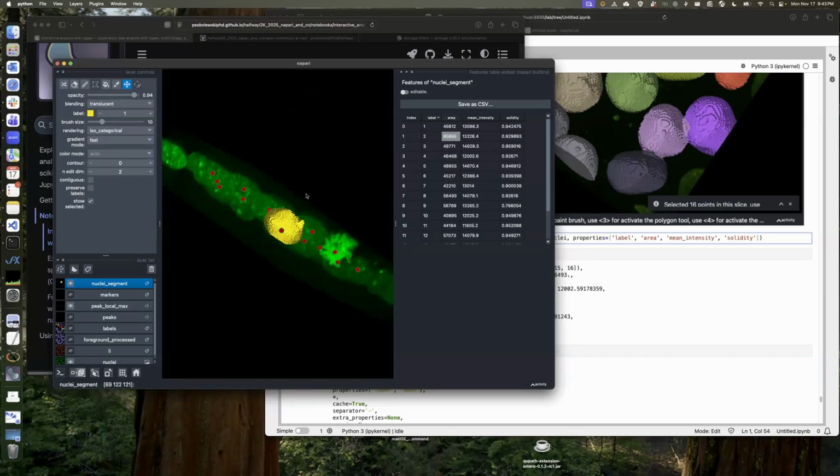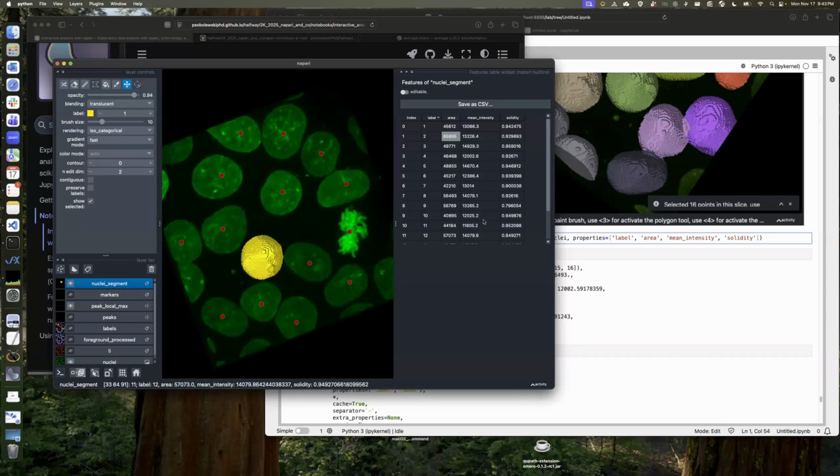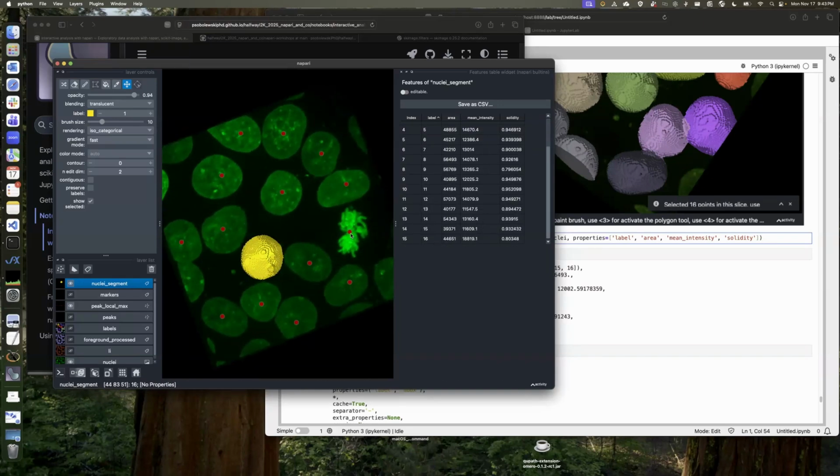Yeah, I guess this one's the biggest, huh? Interesting. It doesn't really seem that big, but I guess it is. But I don't understand why that last one isn't included in the thing.